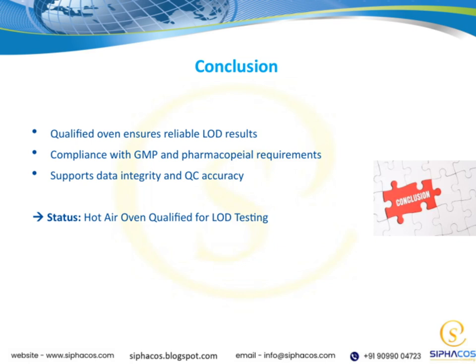Currently, our status is that the hot air oven has been qualified specifically for LOD testing. This achievement reinforces our commitment to quality and regulatory compliance, ensuring that our testing processes are both reliable and compliant with industry standards.